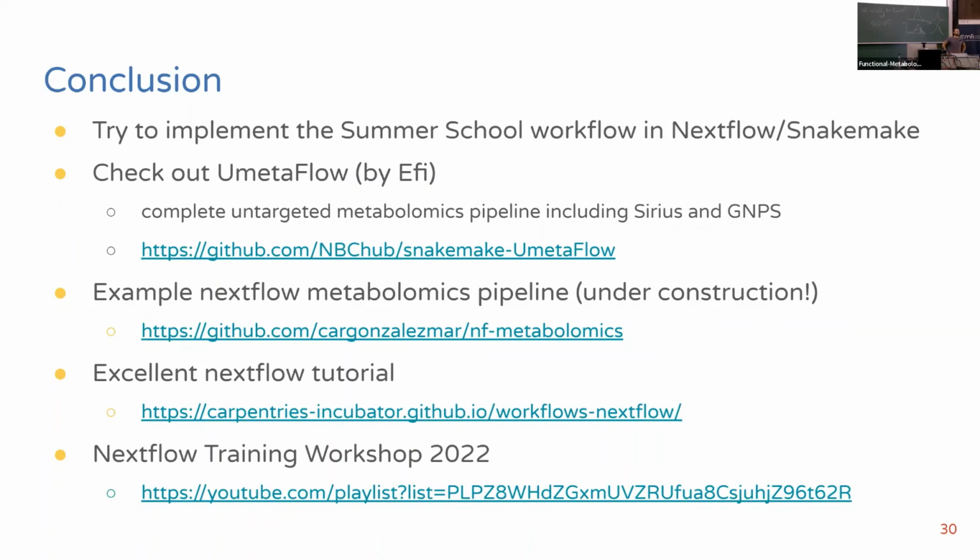I was just wondering, and maybe you can give a recommendation to the participants. What's the number of data sets that you should process per month that makes it worth putting into a pipeline, like the ones we present during the week here, in a Nextflow workflow? That's hard to say, but if you have a standard LC-MS method that you run more often in your lab, then it's totally worth it to invest some time. Of course, if you have a special method that you test just one time, you might be better off with an interactive Jupyter notebook.